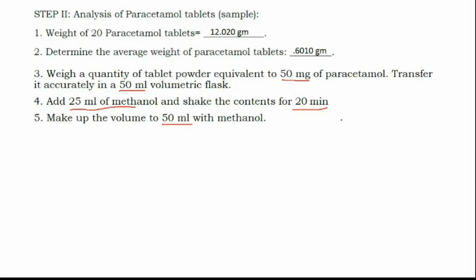So we had taken 50 mg of paracetamol and we are dissolving it in now 50 ml of methanol. So what is the concentration of this solution now? Tell me in milligrams as well as micrograms. 1 milligram per ml is right. How much in micrograms?